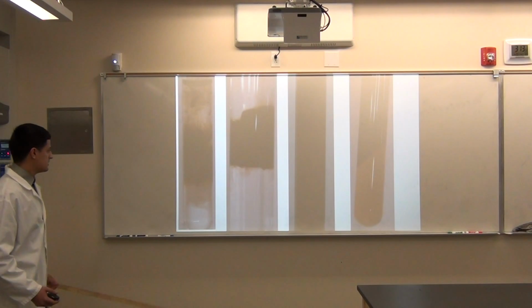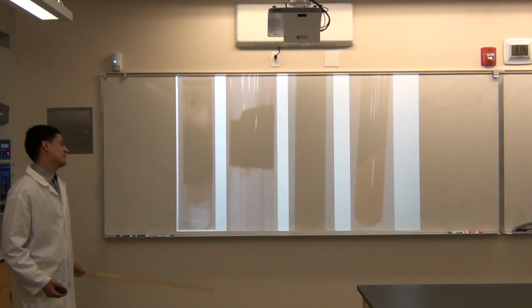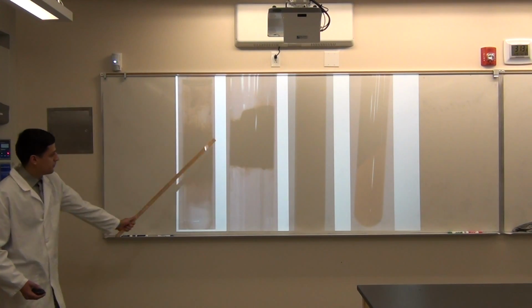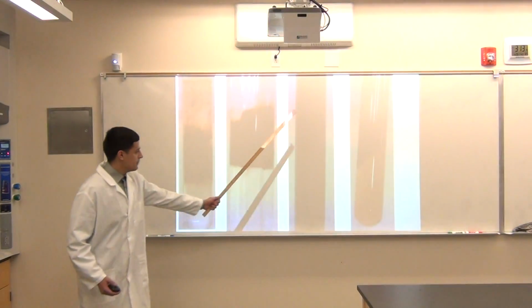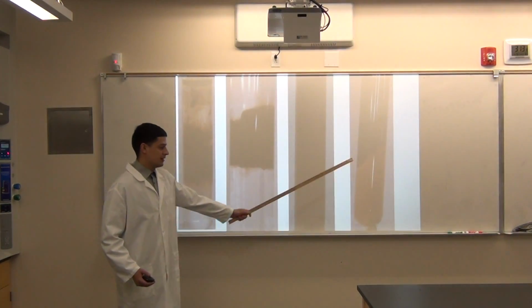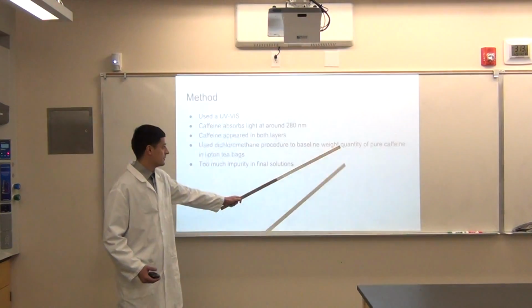These are just some pictures of test tubes when I mixed the same mixtures of caffeine, PEG, and ammonium sulfate. This is the test tubes before the centrifuge, because I put this in a centrifuge. I mixed up the solution, and this is what popped out of the centrifuge. Again, a lot of other gunk. This is not a viable method for purifying caffeine.